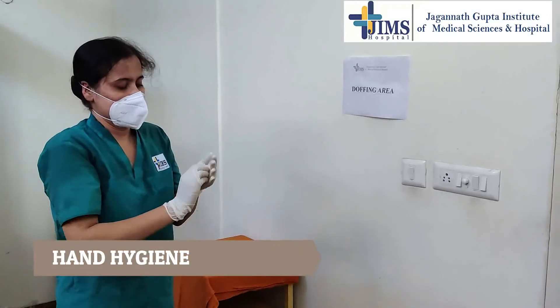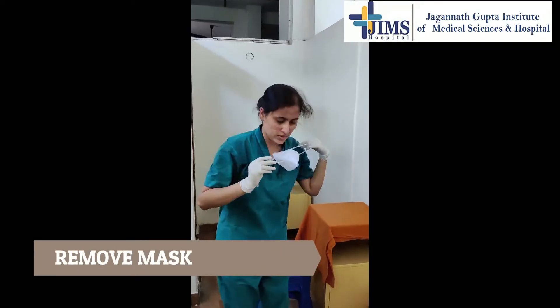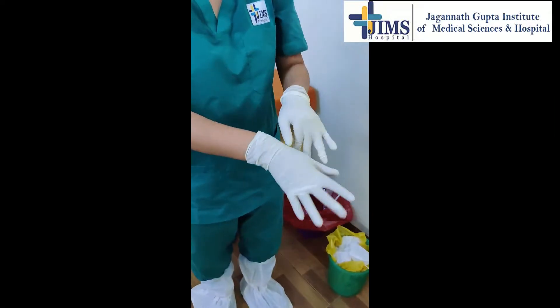Perform hand hygiene on gloved hand. Remove the mask from behind the head, dispose of it safely. Perform hand hygiene on gloved hand.